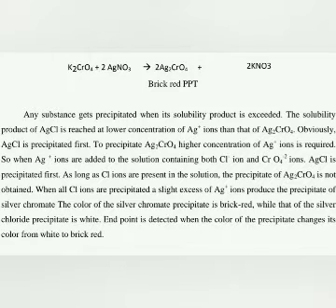This brick red color is nothing but the end point of the titration, because we start the titration with water and that water is colorless. So when the colorless solution gets converted into brick red, then this is the end point of the titration. This is just the theory about the experiment. How that particular titration takes place, we will see by using this procedure.